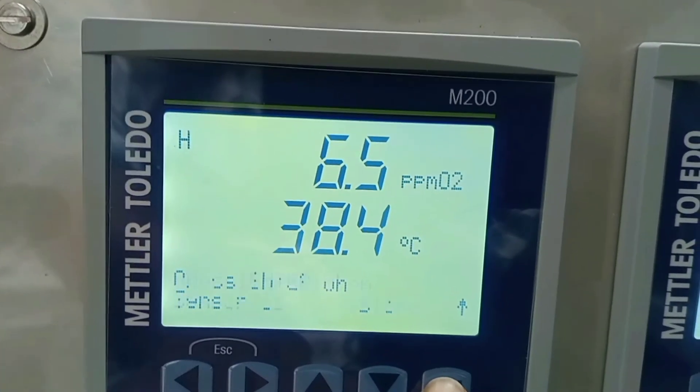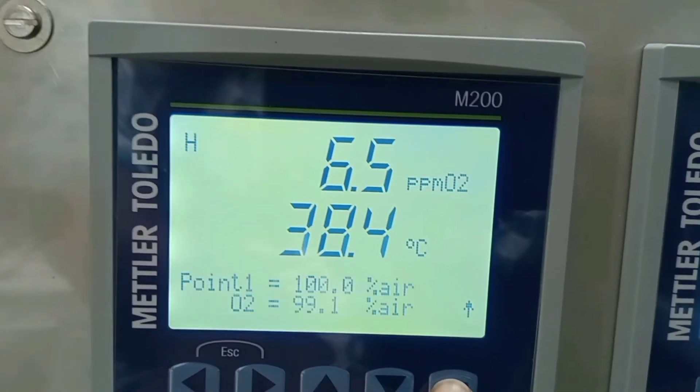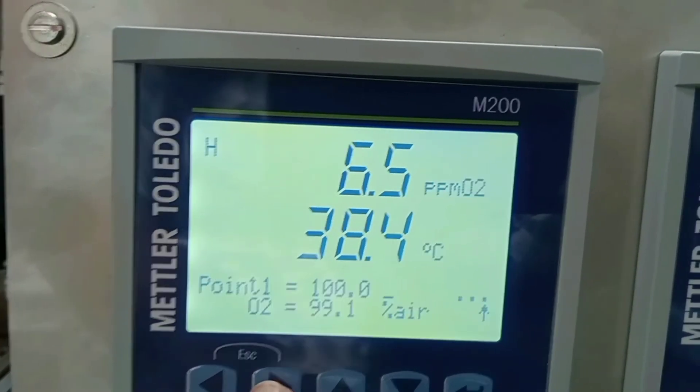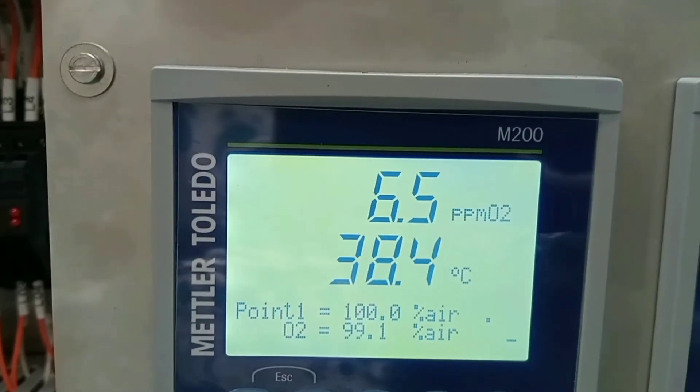On the calibration tab, select calibrate sensor and press enter. Select one-point calibration and enter. Now we will calibrate to percentage air, so we will select one hundred percent, as we are calibrating in air.